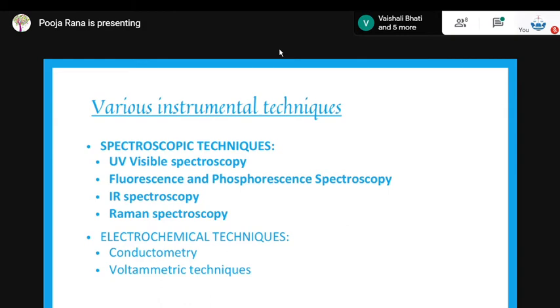All right. Now, in fluorescence and phosphorescence spectroscopy, before I start, I wish to know how many of you have heard about the phenomenon of fluorescence? Do you know what fluorescence is?